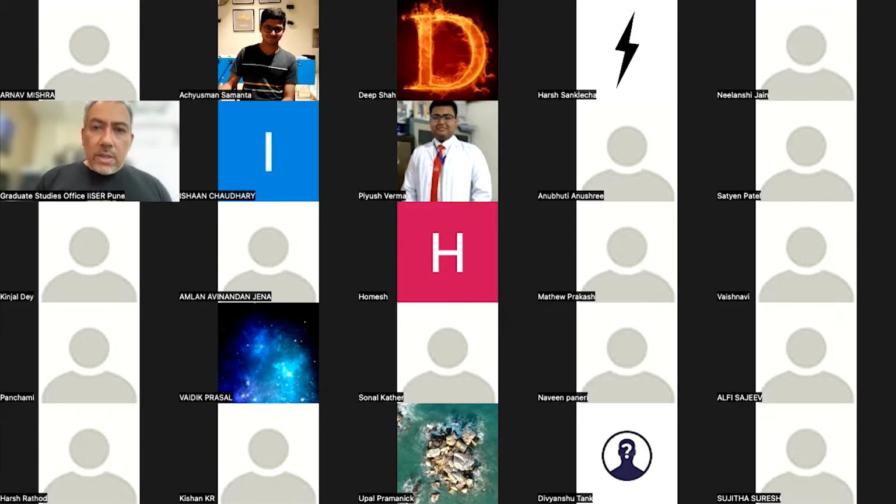Right. So one of the challenges here is the amount of light, because you're looking at very small objects. Even though the microscopy slide on which you have put something to look at has enough light, at that magnification or focus, the amount of light getting into your objective has a significant impact on the quality of the image that is generated.